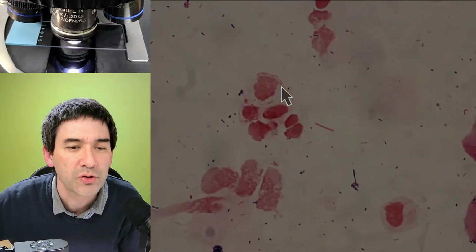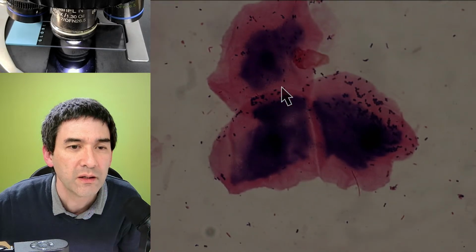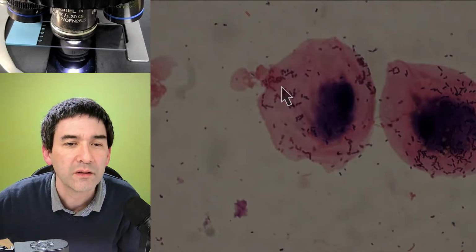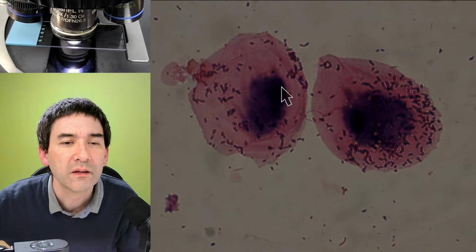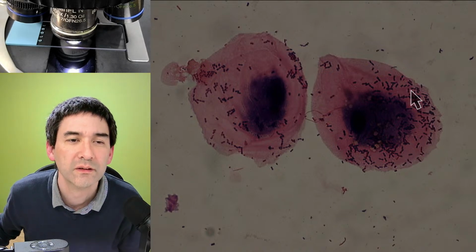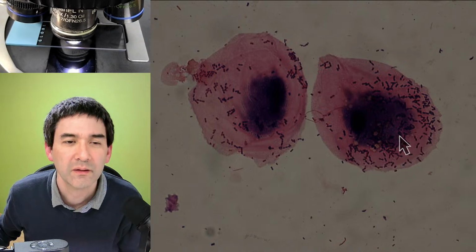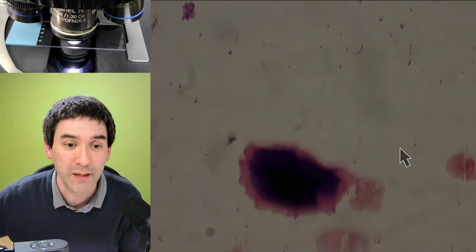I wonder what these patches are, because judging by the size they seem to be cells. Look at this. Are these all bacteria on the cell here? Yeah, they're kind of sticking to the epithelial cell. Yummy. It shows how many bacteria there are in your mouth, or in my mouth in this case.